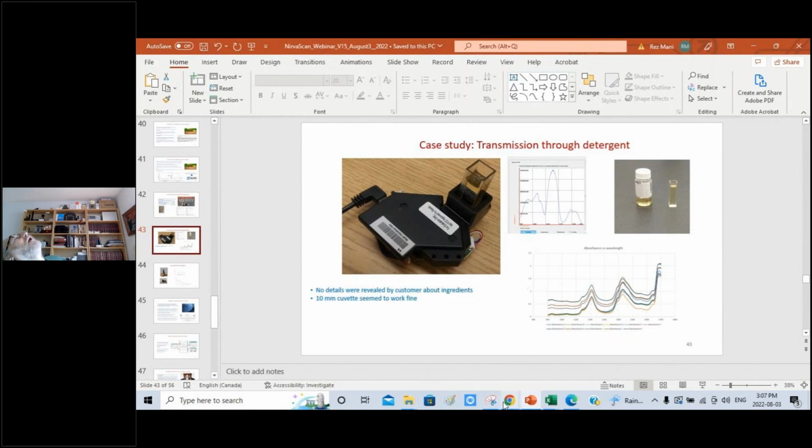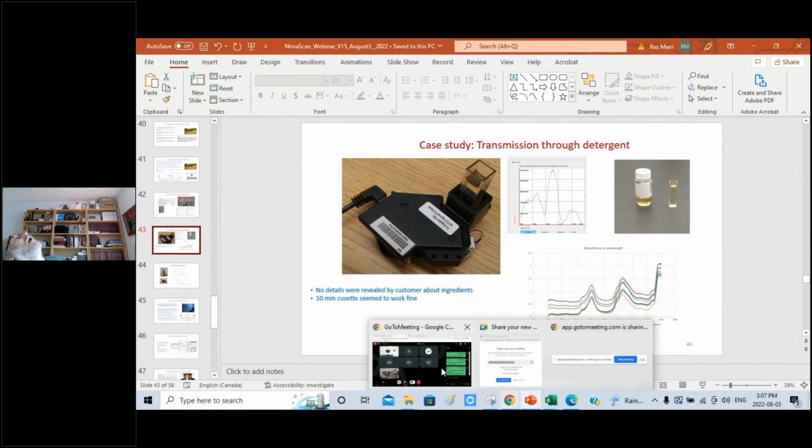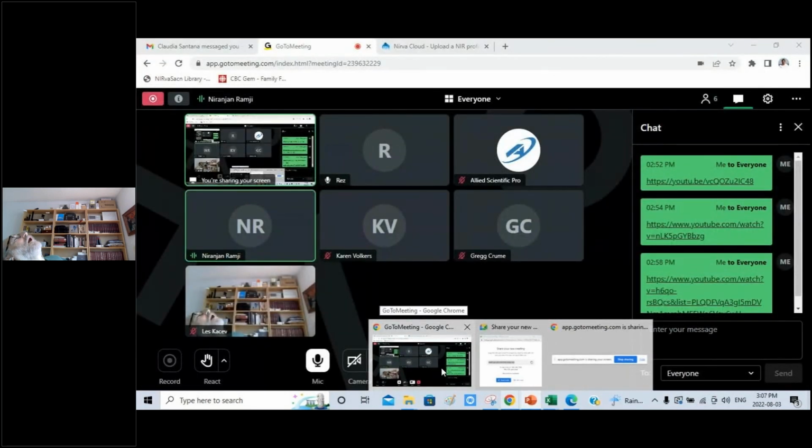Just one quick fundamental question: when you did the calibration curve for, say, wheat, you have to generate the data from a large data set. But can you also use this for discovery-type work, where you are looking for trends that may be used to predict an unknown factor?